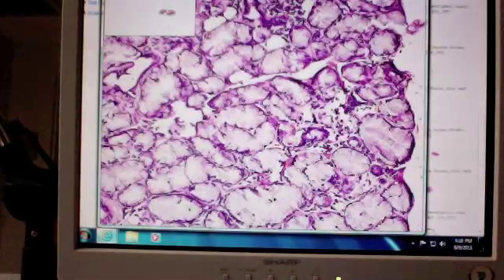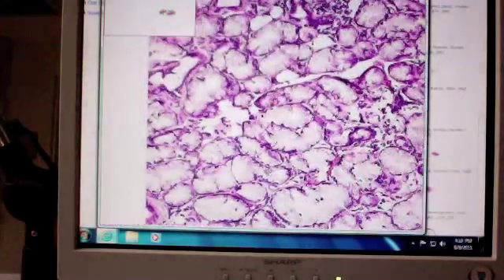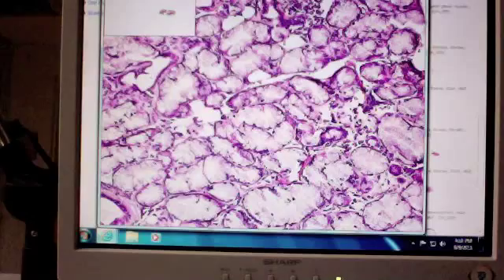All right. So this is fairly low magnification. We're at 10 times magnification. We're filling up the whole section here. If I said to you, name this structure. Where's my next victim? The whole thing. There's no pointers. Just name this whole structure.